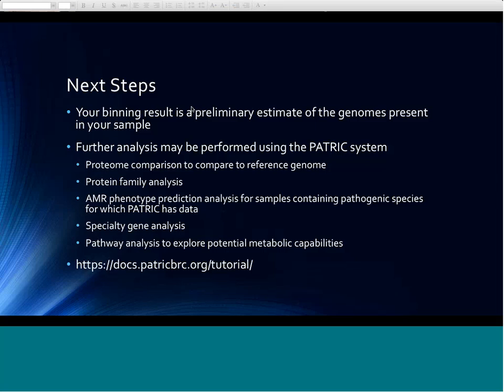Okay, there was one callback here to the previous discussion about taxonomy. It's more useful in the person's opinion to have both a name and confidence level in that call as opposed to just a name. So they would like to see a confidence level in the taxonomic specification. Yeah, we should be able to provide some sort of scoring along with it.